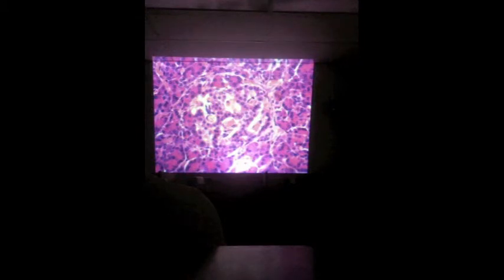You can see you've got these ropes that are all weaving into this glomerular shape, and there's red blood cells through here, right? You can see vasculature. If we go through all of these endocrine glands, we're always going to see vasculature. Why is there always vasculature present in these endocrine glands? Because they're making hormones, and so why do you need vasculature with hormones? Yeah, so you need that transport system: as the cells secrete it, it goes into the blood to be delivered to distant targets, right? Endocrine signaling is to a distant target.